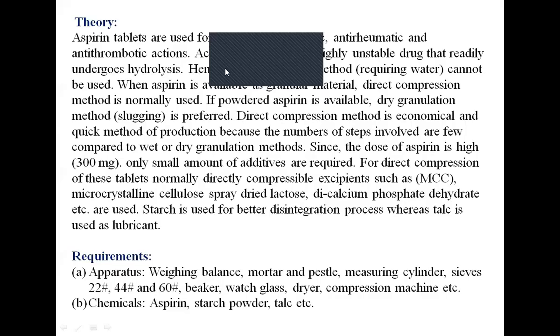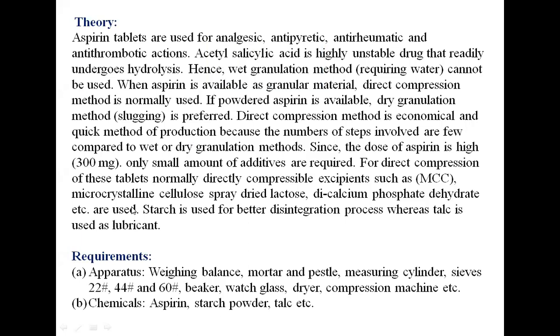Aspirin tablets are generally used for analgesic, antipyretic, anti-rheumatic, and anti-thrombotic actions. Acetyl salicylic acid is highly unstable, and the drug readily undergoes hydrolysis, hence wet granulation cannot be used. The major difference is that wet granulation requires water for the granulation process, while dry granulation does not require any water or water moiety. So wet granulation cannot be used for this particular purpose.